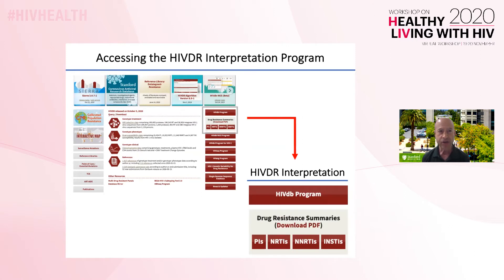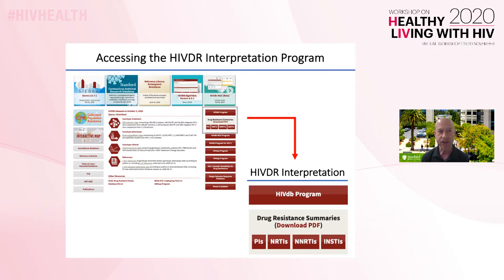You can access the interpretation program and the pages containing supporting educational material at the upper right part of the homepage. Clicking on the HIV-DB Program tab will take you to the most commonly used form for entering data — the one that allows clinicians to enter lists of mutations in the RT, protease, and/or integrase genes.